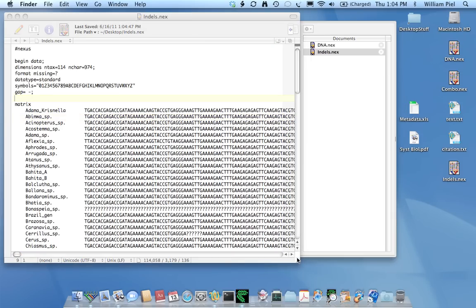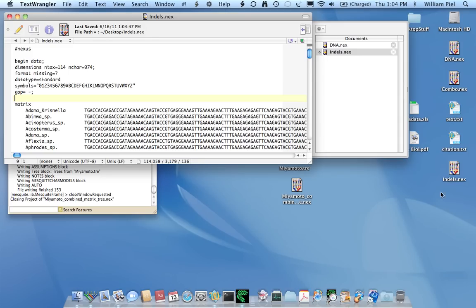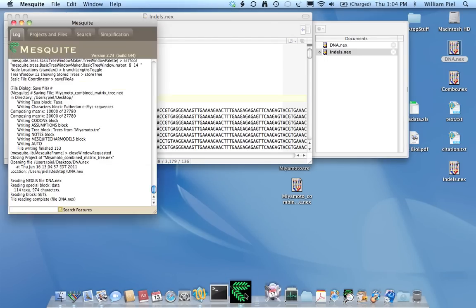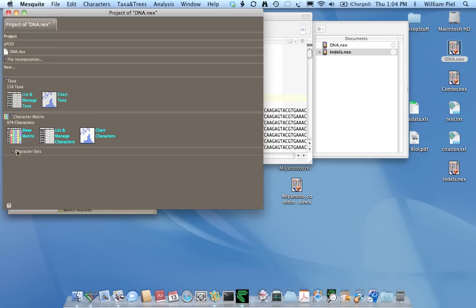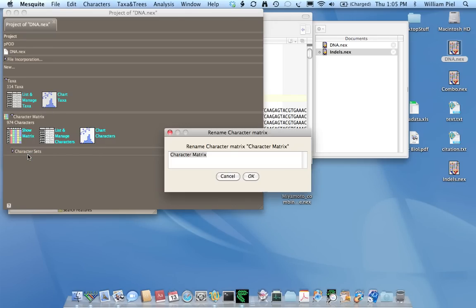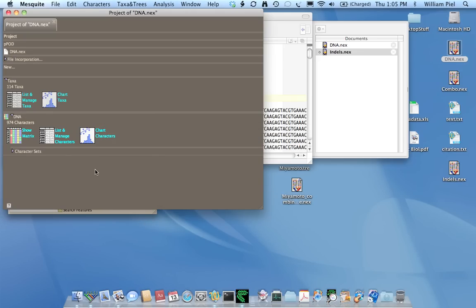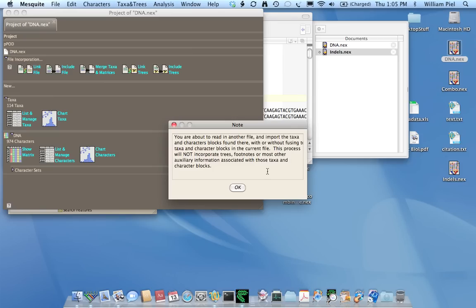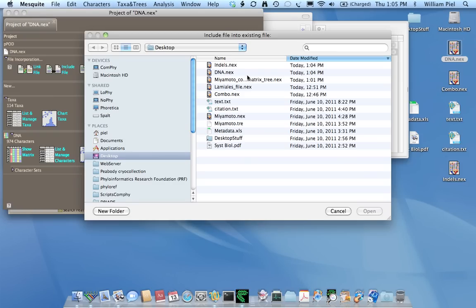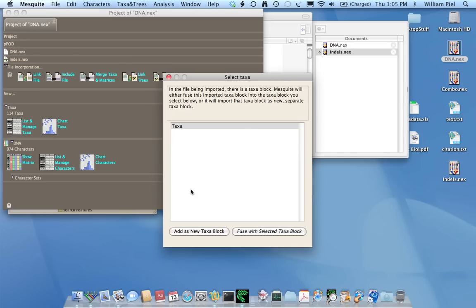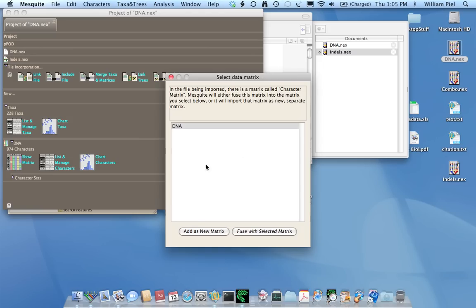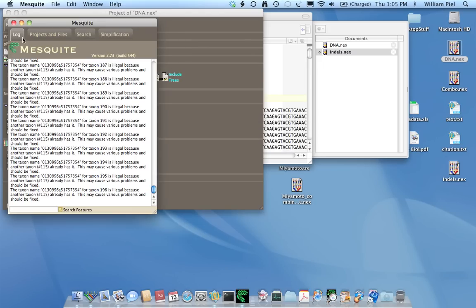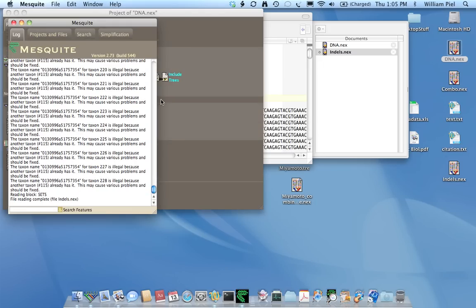Now, I can open the DNA data in Mesquite. So here's my DNA data. And I could rename this, for example. I'll just call it DNA. And now I want to import the indel data. But I want to use file incorporation to make sure that both of these data matrices anchor off of the same set of taxa. So I'll ask to merge them, and I'll choose indels. And I'm going to say fuse with the selected taxa block, but add as a new matrix. And there we go.